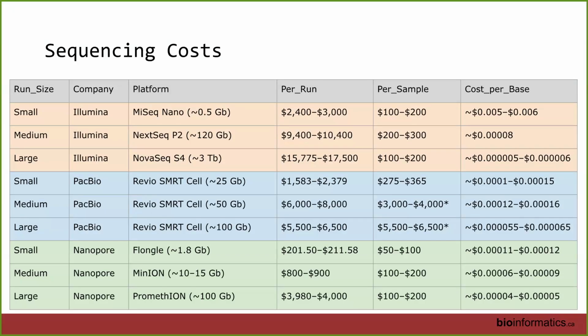dictates that. So this table, again, it's a little bit small. We don't need to worry about it. You can look into it. I did this on my own, so it's not all going to be perfectly accurate, but it gets the point across that there are per sample, per run differences between these different technologies. Illumina is by far the cheapest with respect to high throughput, but long read is closing the gap with respect to the PacBio HiFi. And especially, and I was talking to Stephen about this earlier, if you're looking at per base or per run, perhaps there's a big difference.